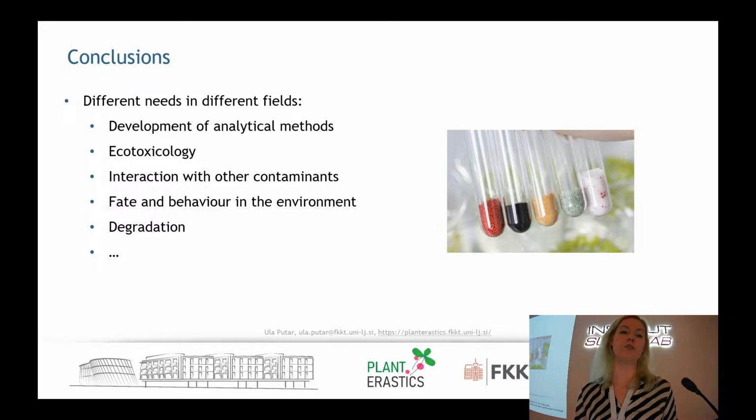Like I said, if you are developing analytical methods, then of course the first thing that you will use are spheres. But on the other hand, if you are doing more environmental studies, then of course you should always have environmentally relevant microplastics, and of course you always need to characterize them, because only with characterization can we really connect these specific characteristics of microplastics with the specific effects that you observe during your experiments.